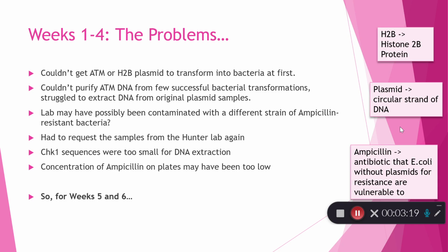And so at some point I was able to make successfully designed primers for CHEK1 sequences. However, after doing PCR to take out these sequences and amplify them, it turned out that these sequences were too small for DNA extraction. The kits I had for DNA extraction required a higher number of base pairs than the DNA sequences that I had for CHEK1.